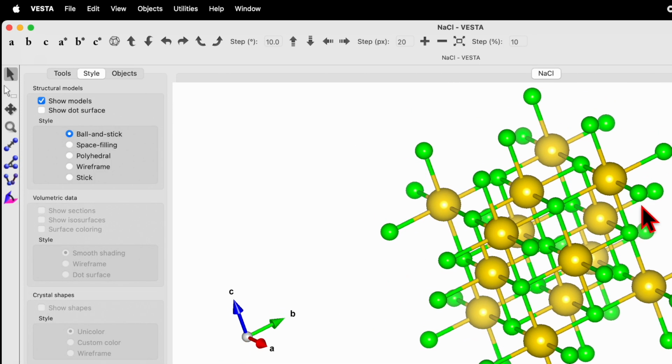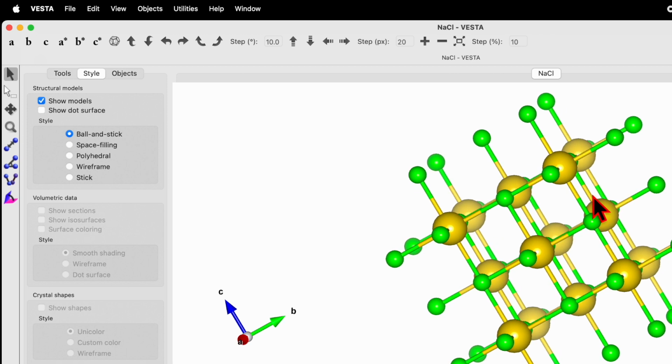Okay, I hope through this video you learned how to draw a unit cell from scratch, how to create a CIF file, and also how to draw a bond.